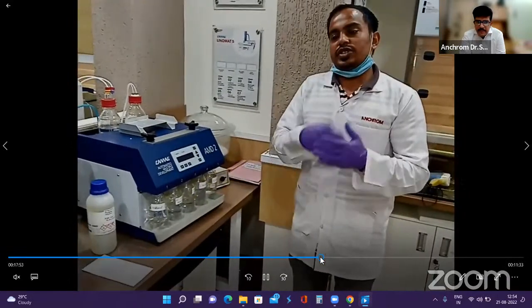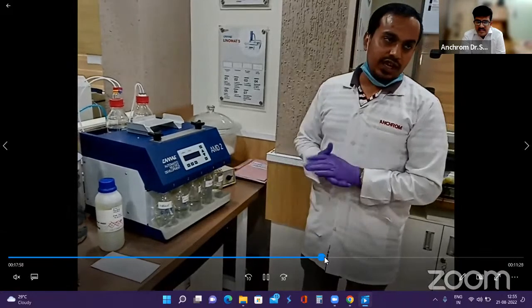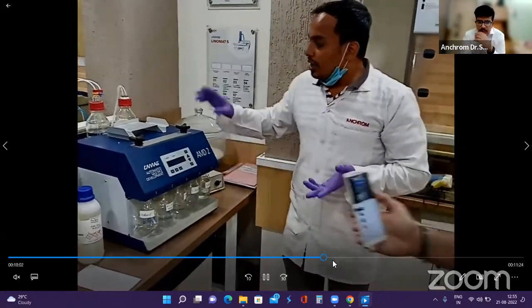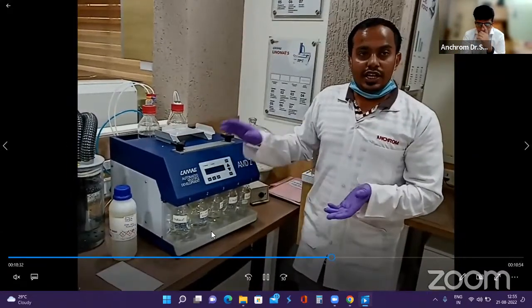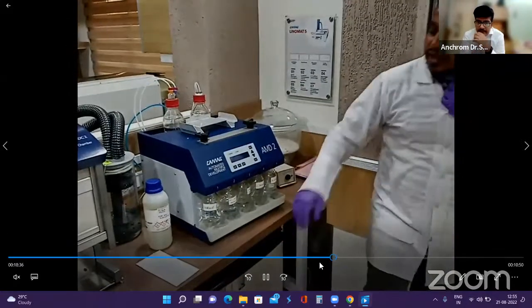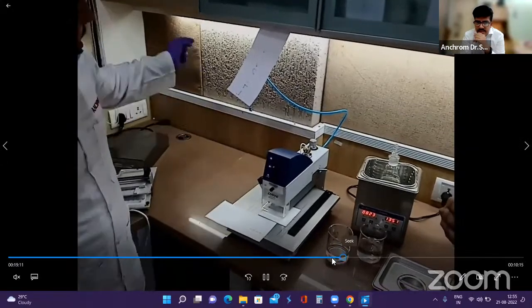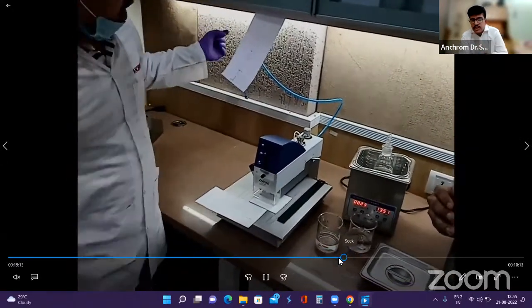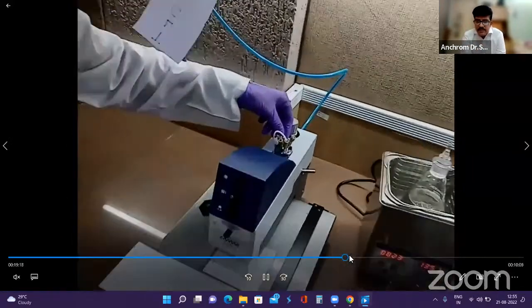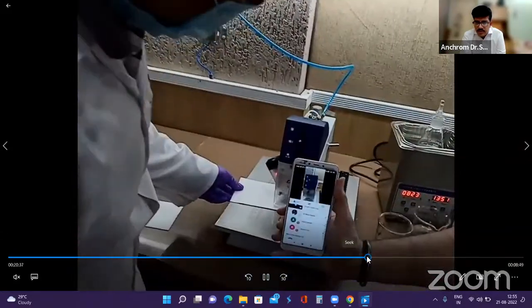Now this is the AMD2 I was talking about. Here it is, and you get a vacuum pump which sucks out the solvent fumes after each and every development, and you load the plate on the top. There are 5 different bottles of solvent at the bottom, and you can unscrew them and load the plate inside this. This is the TLC MS interface, and there the gas connection comes in. I have a small video especially on TLC MS interface, and I'll brief you on that. So let us go quickly to this video.